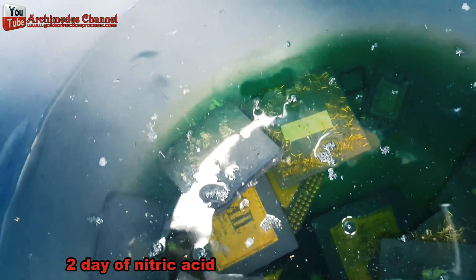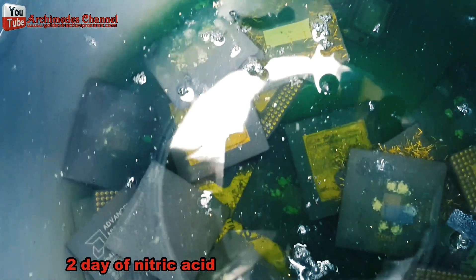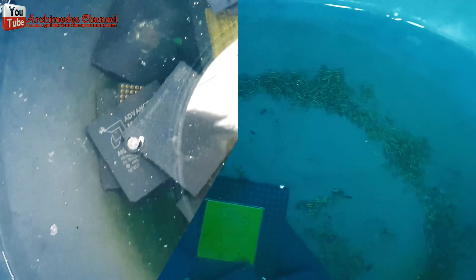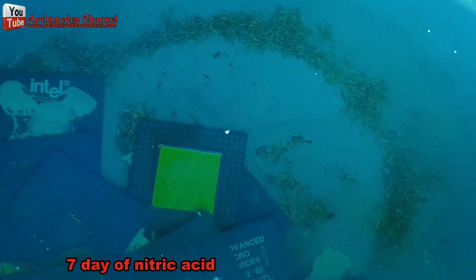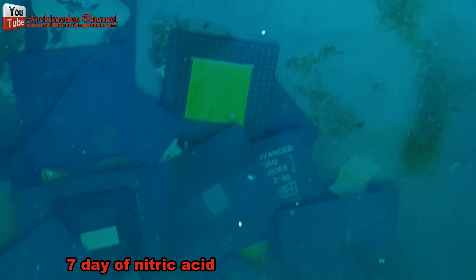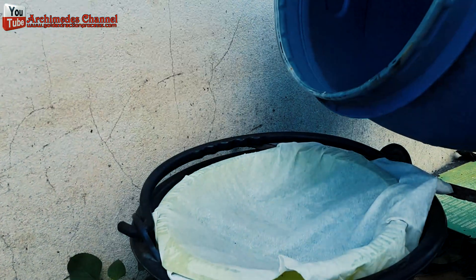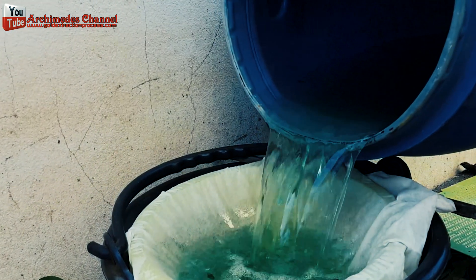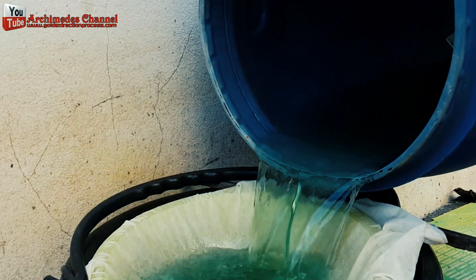Put one liter of nitric acid in the plastic bucket. After 2 days of nitric acid, then 7 days of nitric acid. It takes about 7 days for the CPU pins to come off and the silver to dissolve. Chemical water filters — we will precipitate the silver from the chemical water before going to gold recycling.